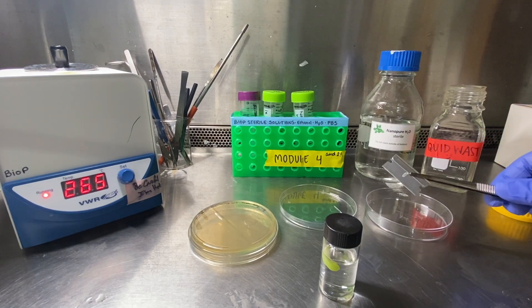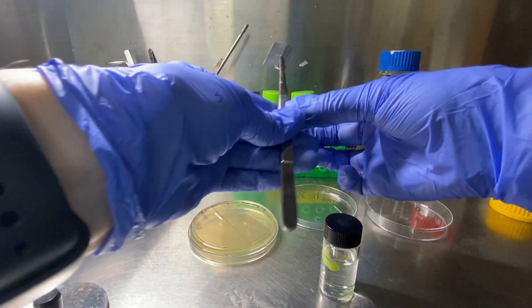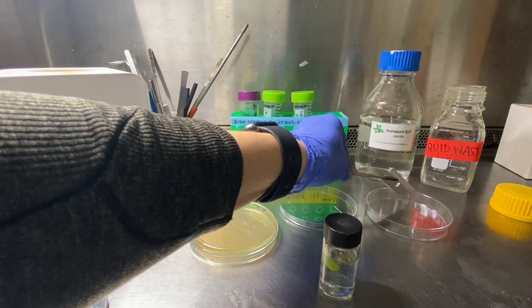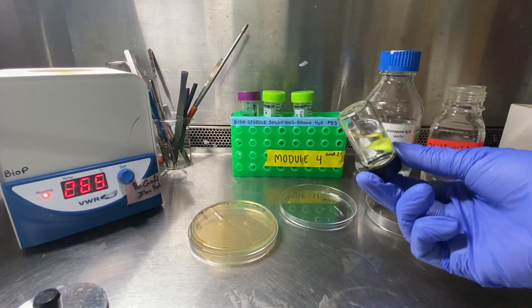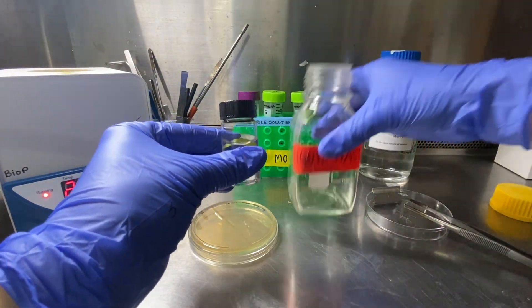We're going to make sure our razor blade is sterile by putting it in the bead sterilizer, and we're going to leave it in there for about 30 seconds, and we'll go ahead and set it on that petri dish. It will be hot, so don't handle it with your hands. We'll sterilize our forceps, and now we're ready for the washing steps of our leaf.